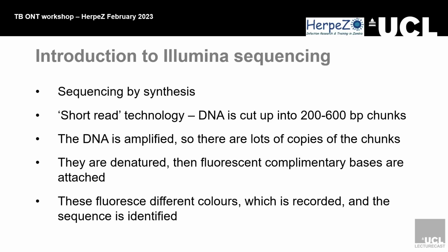The DNA is amplified, so you get lots of those chunks of DNA, and then denatured, and fluorescently labelled complementary base pairs are attached. The fluorescence of the different colors is what's recorded, and that's how the sequence is identified.